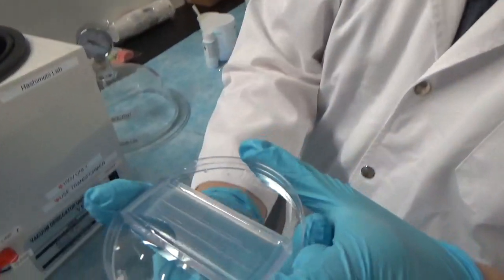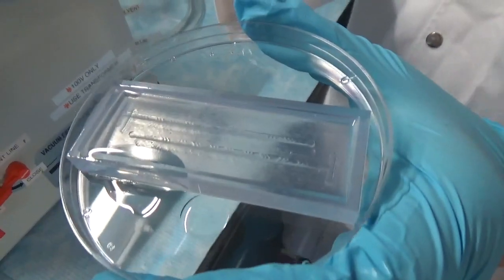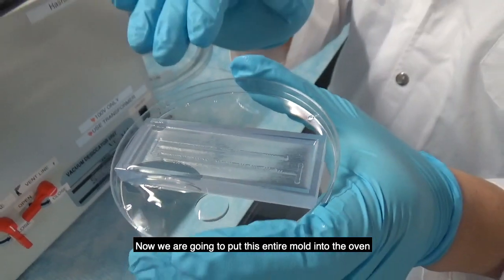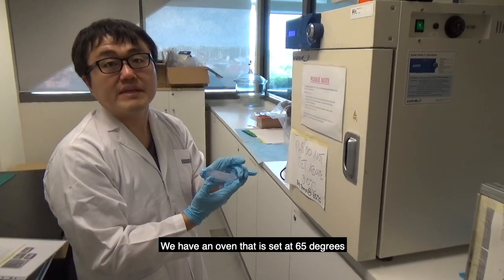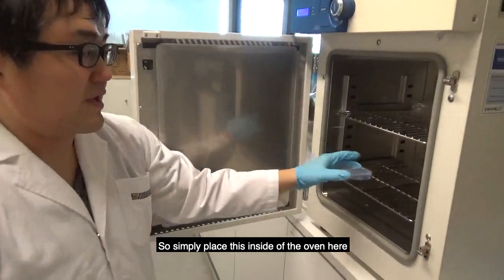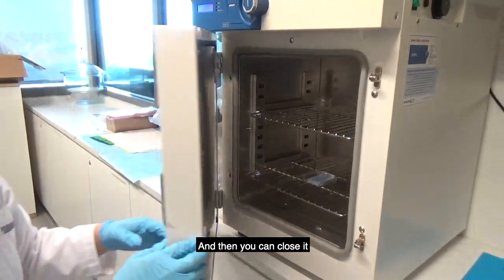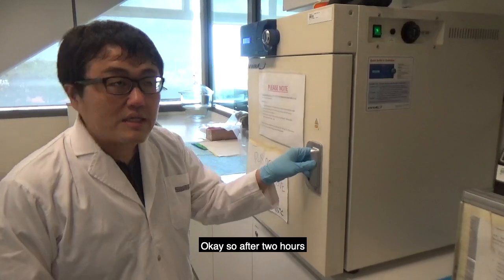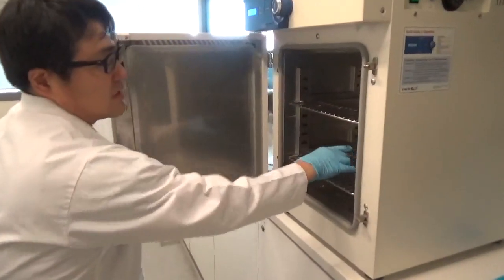This is the PDMS placed on top of the mold. Now we are going to put this entire mold into the oven. We have an oven set at 65 degrees — simply place the mold inside and close it. After two hours at 65 degrees in the oven, we can take it out.